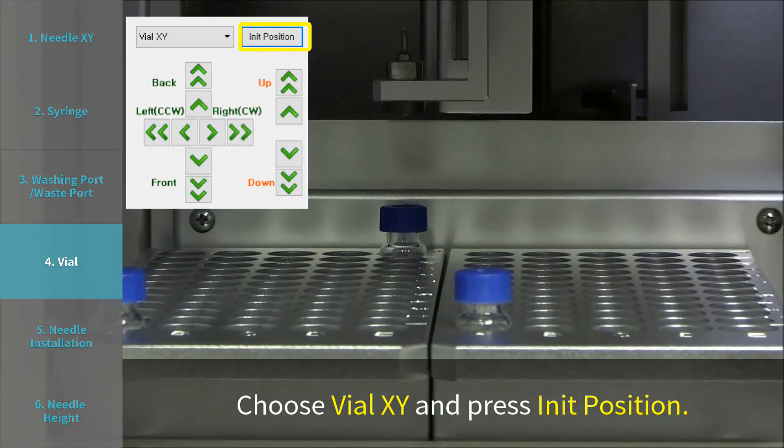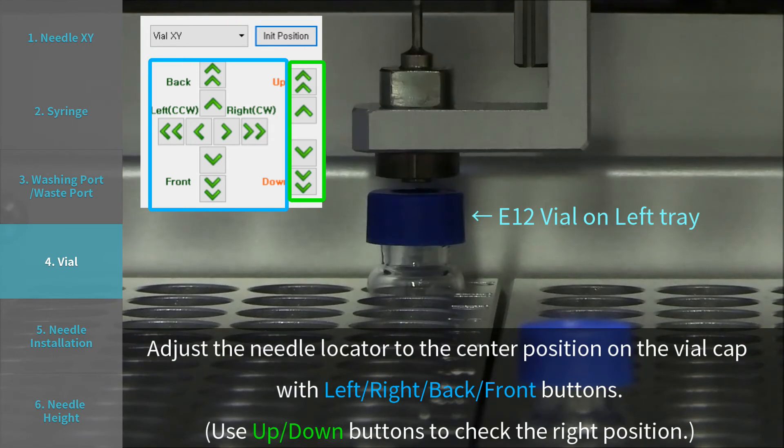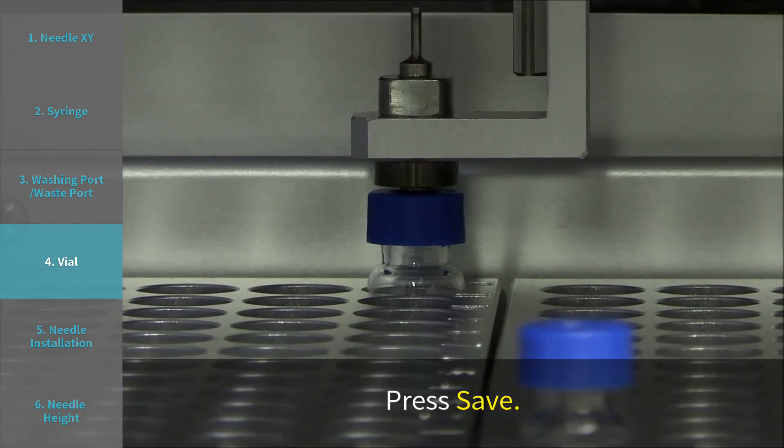Choose vial X Y and press INIT position. Adjust the needle locator to the center position on the vial cap with left, right, back, and front buttons. Use up and down buttons to check the right position. Press save.